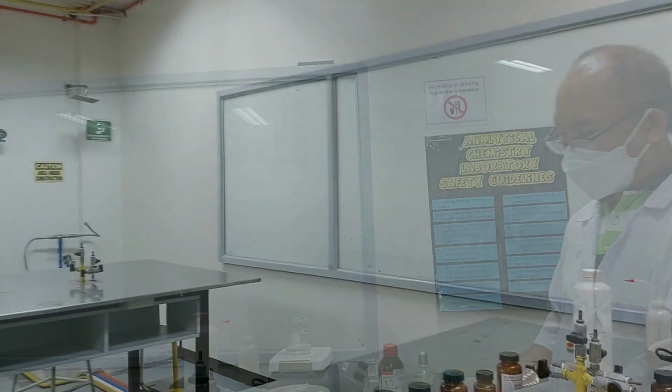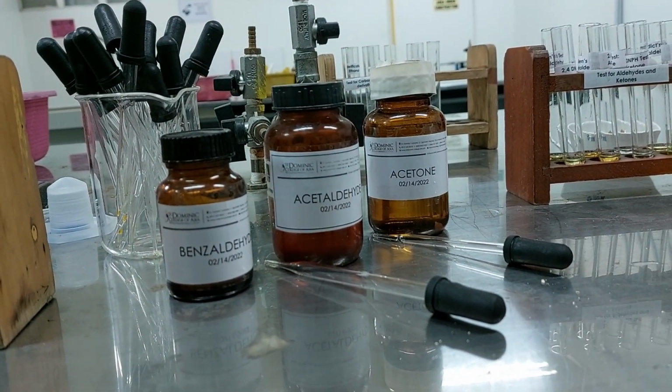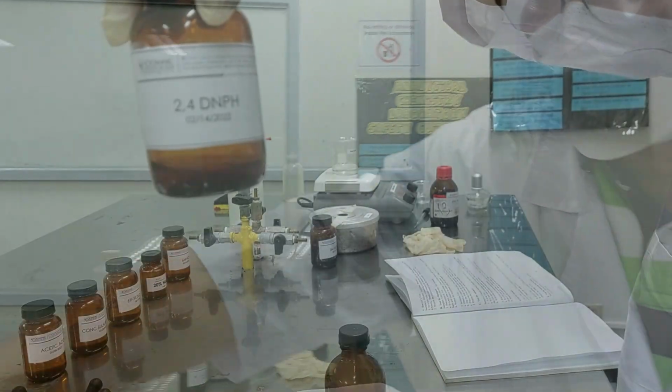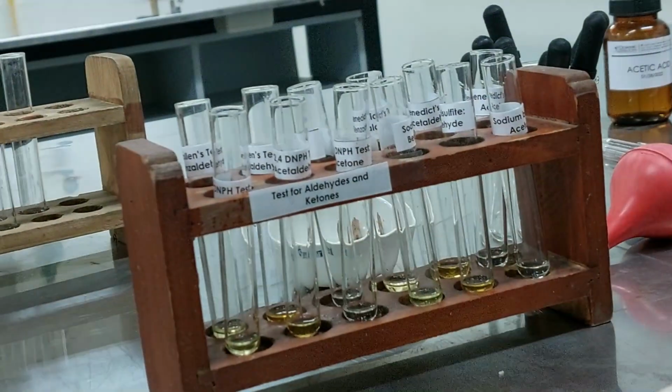Okay, so let's start the experiment. Let's start with DNPH. Our test reagents are benzaldehyde to represent aromatic aldehyde, acetaldehyde, and then acetone to represent ketone. So this is our DNPH. We're going to add 10 drops of this one. So I'll just place it here.